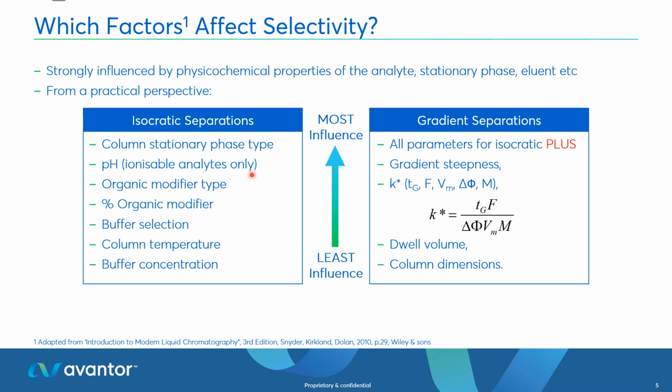So we're going to touch on a few of these today. I don't have so much time to go into the columns, but we will revisit that next time. I'm going to talk more today about the mobile phase choices and one slide on temperature as well.